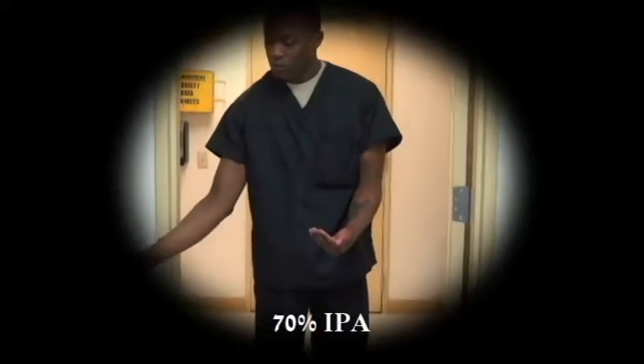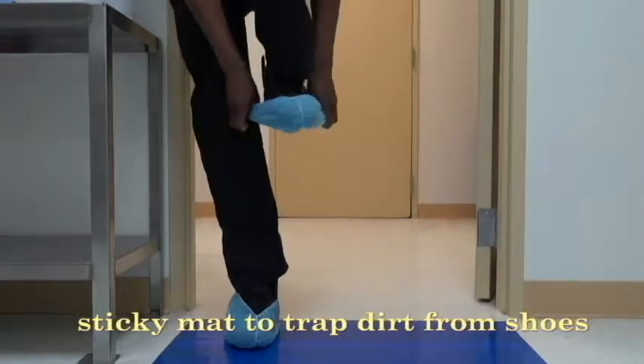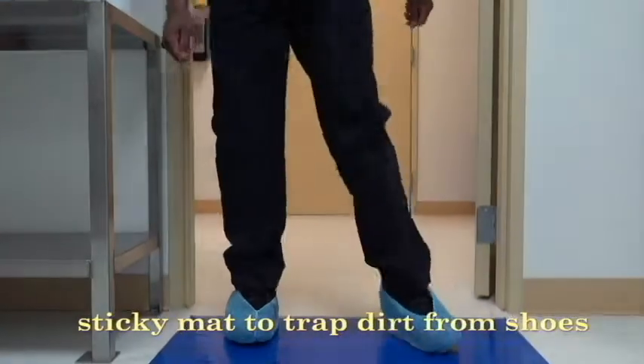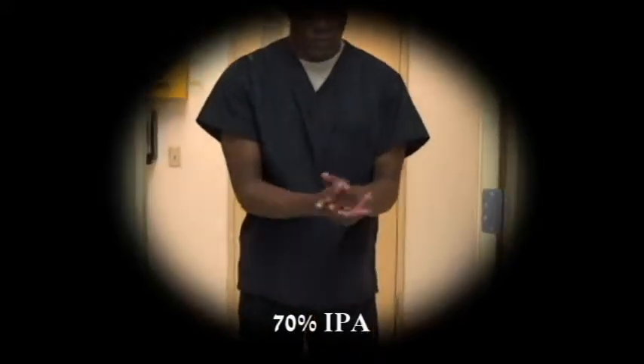Sanitize hands again with 70% IPA. Don shoe covers on the other foot and place the foot on the sticky mat. Resanitize hands with 70% IPA.